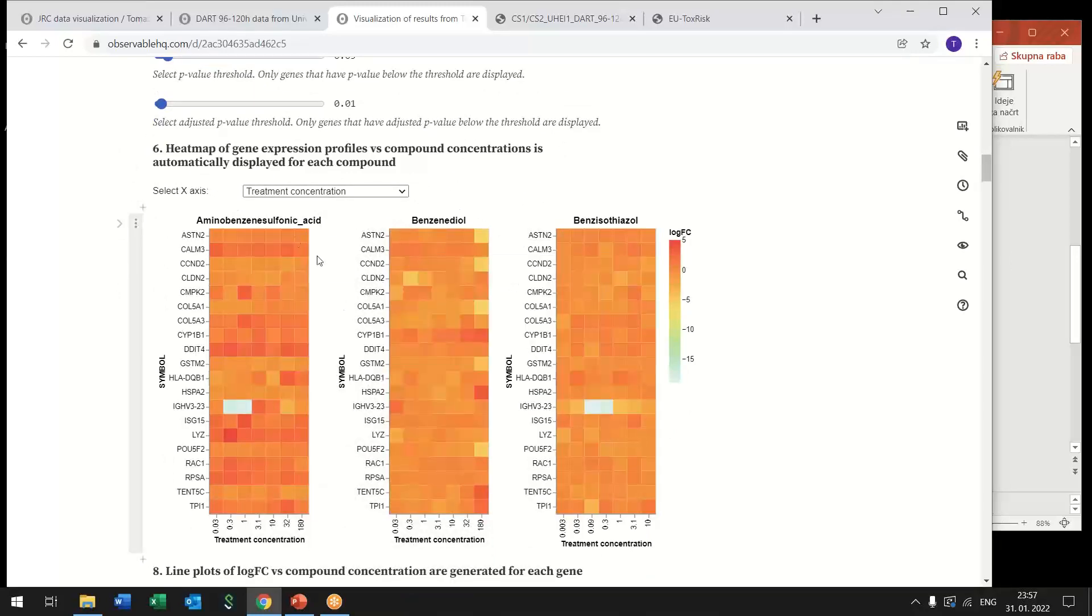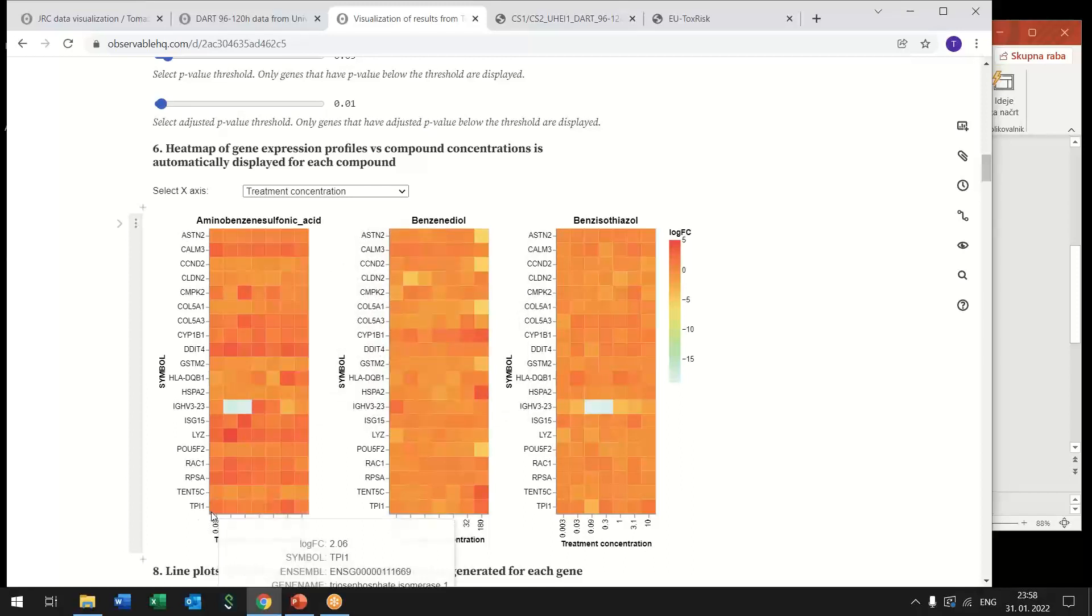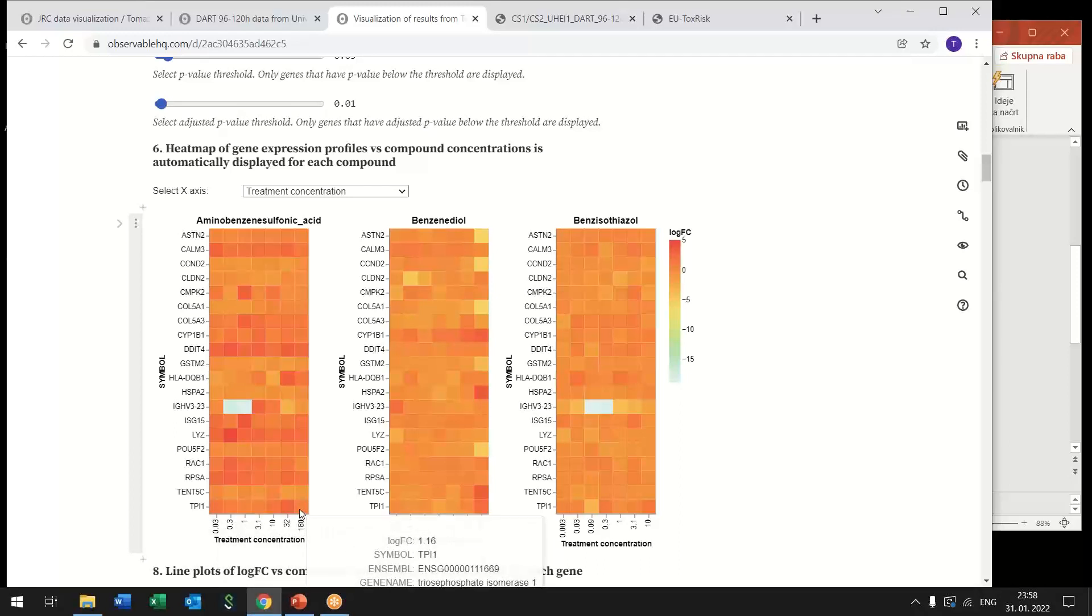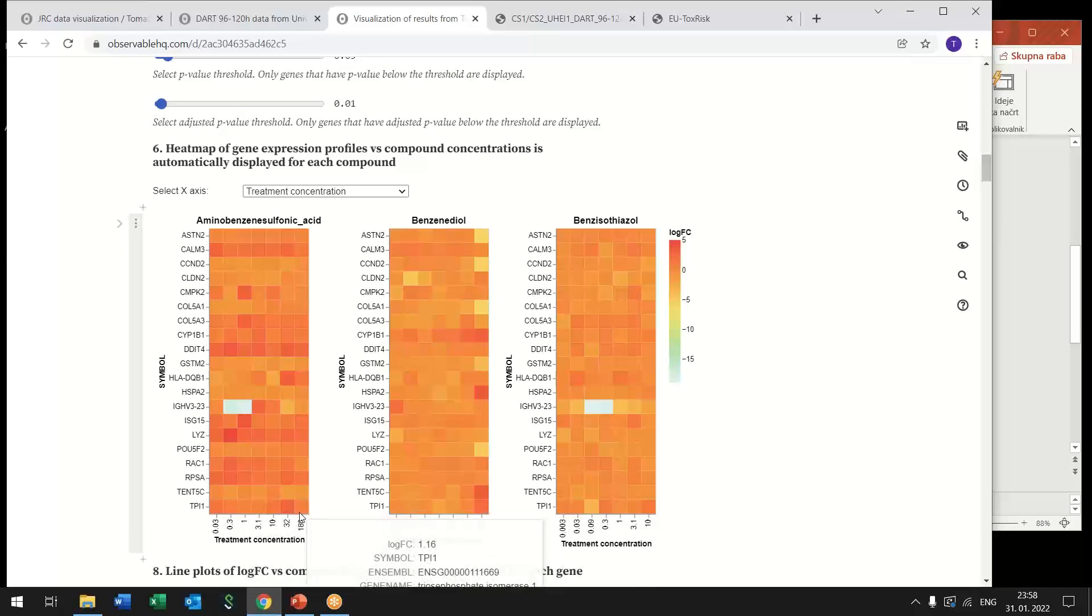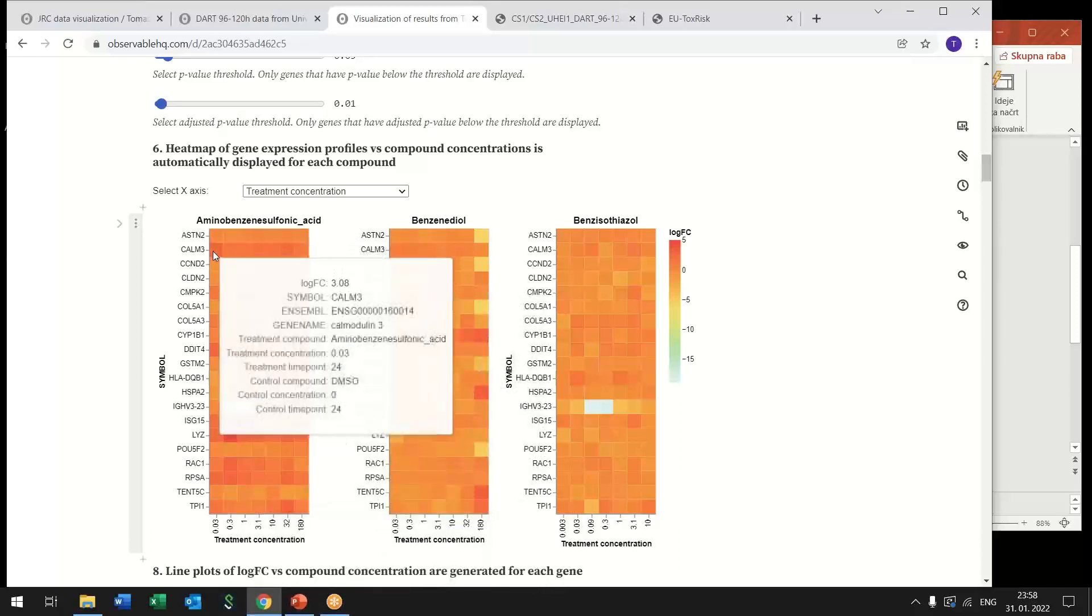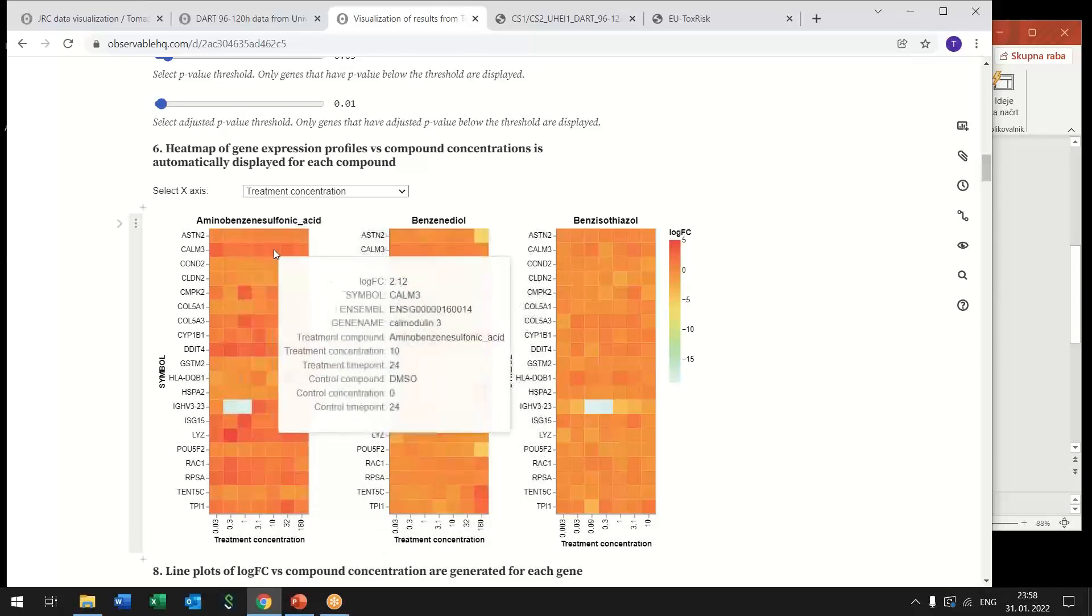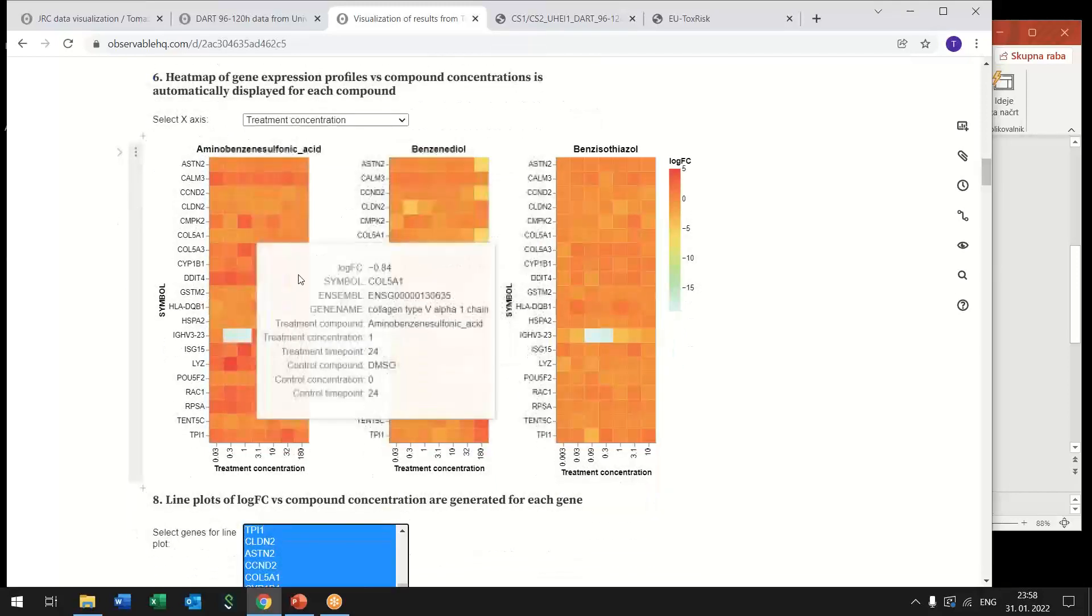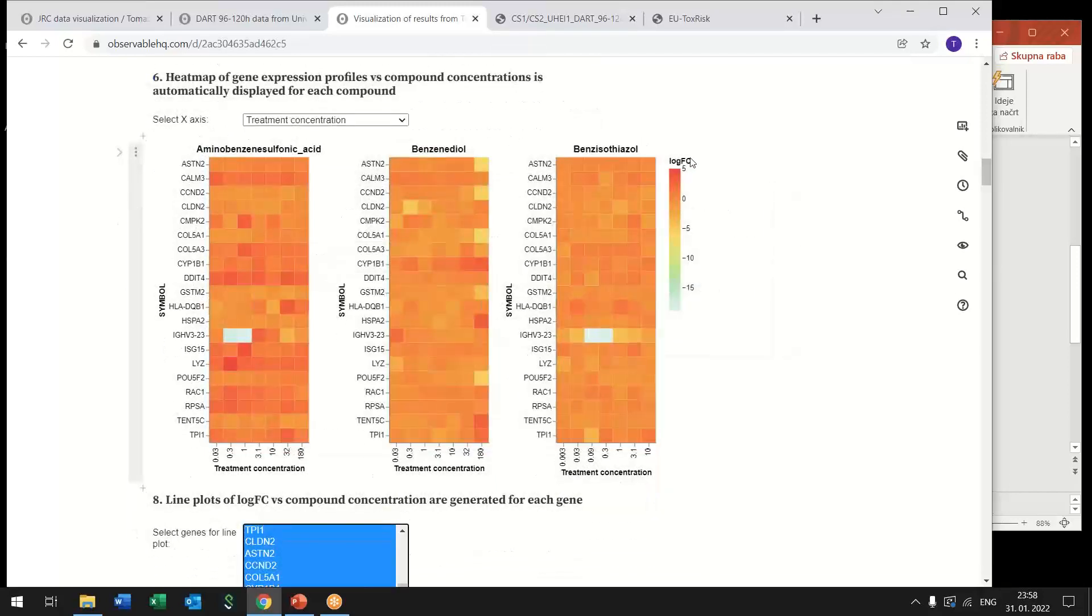And what we see here is a heat map for each of the compounds we get a heat map where we see how gene expression varies with the concentration of compounds so each row is a single gene and from the left to the right the concentration of compound increases and color represents the log fold change.